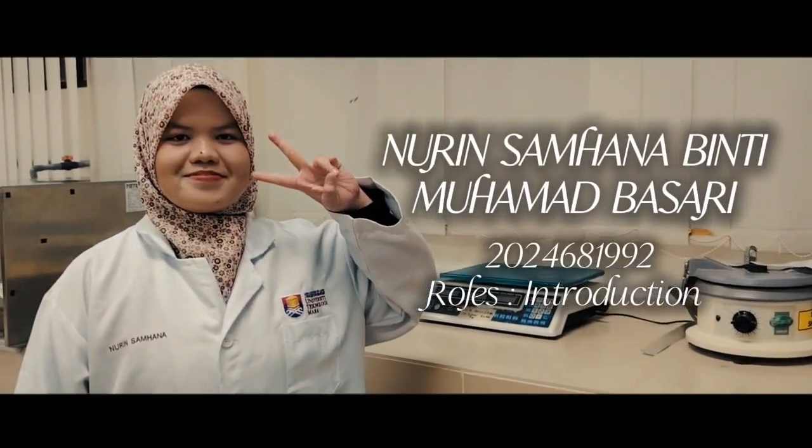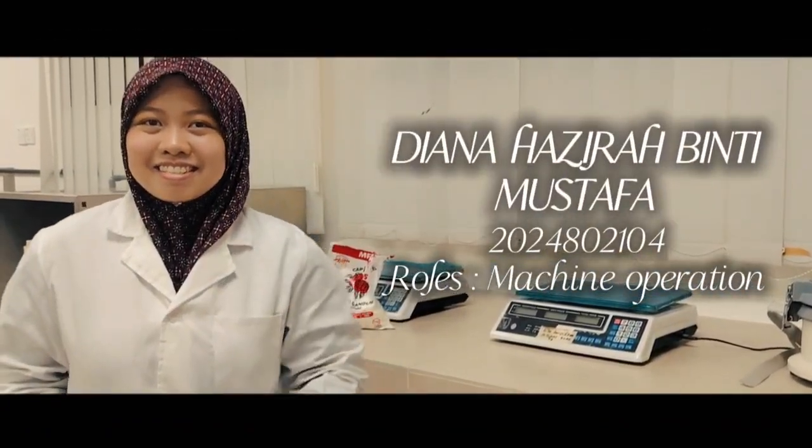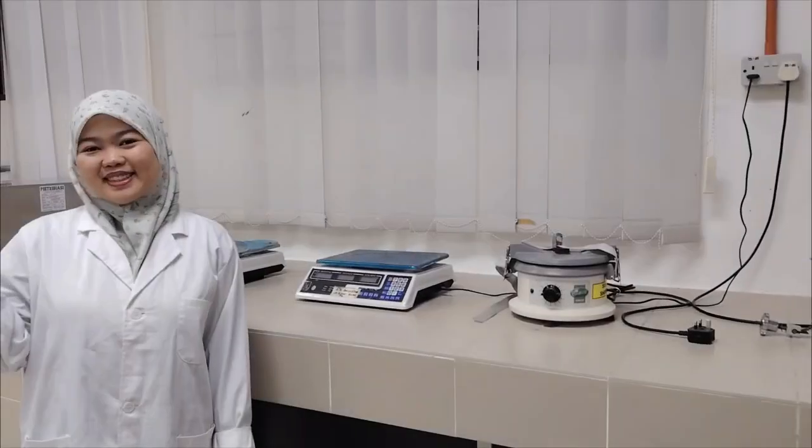We are group 3 and today we will be demonstrating how a test sieve stack is used to analyze particle size distribution in wheat flour. So without further ado, let's get started.